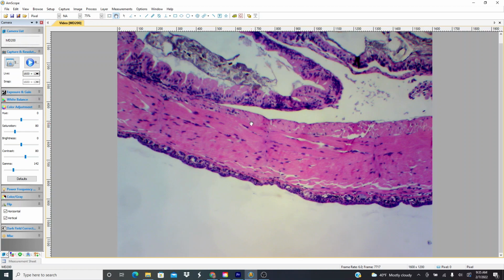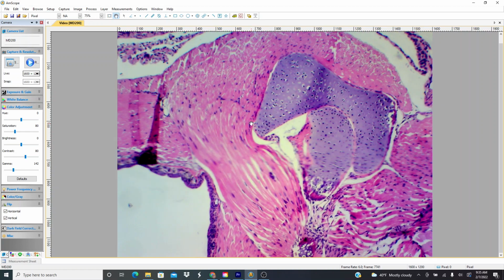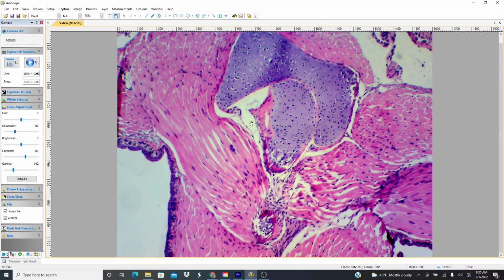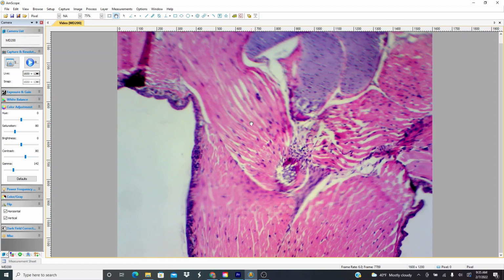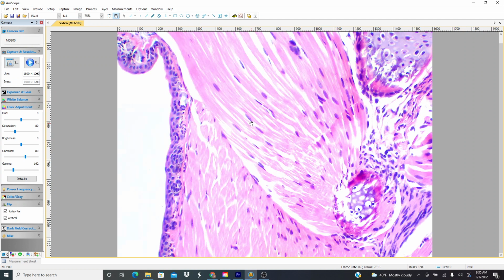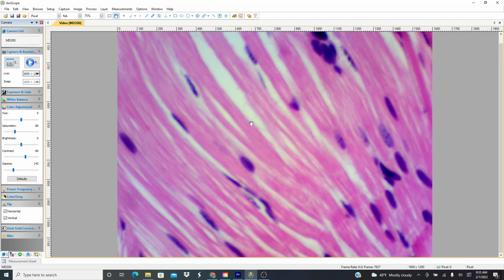So this is the outer, the skin again. Once again, this is, I think, towards the leg now. It looks like we got another joint here, a ball and socket joint. Here's all this muscle tissue. I think right here we see a longitudinal section. We can maybe see the cross banding of skeletal muscle that you can see.